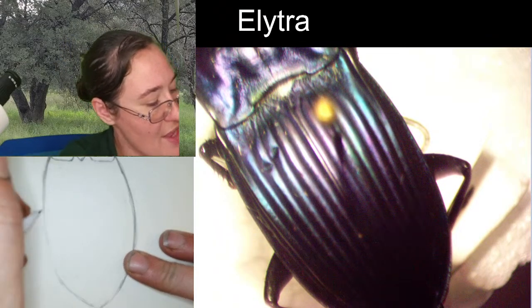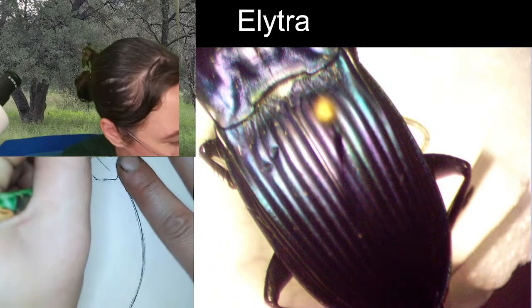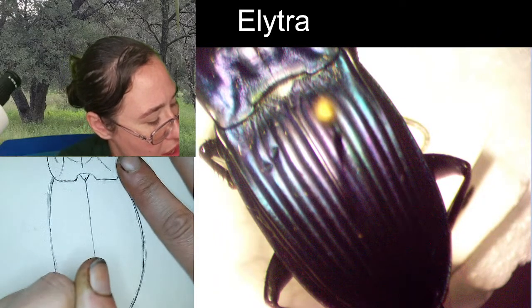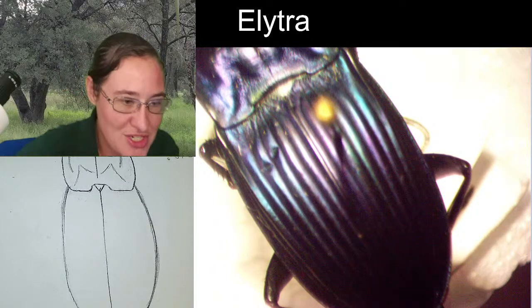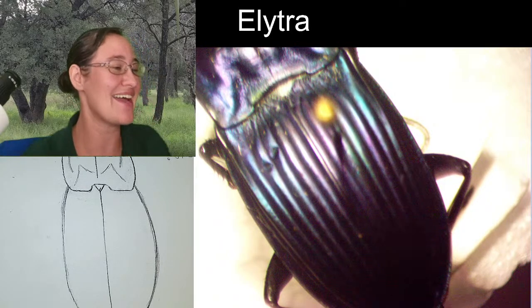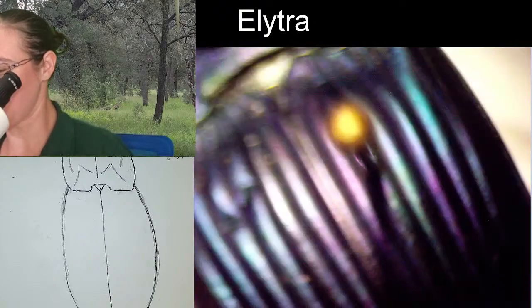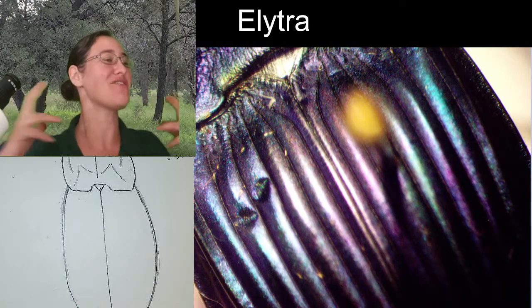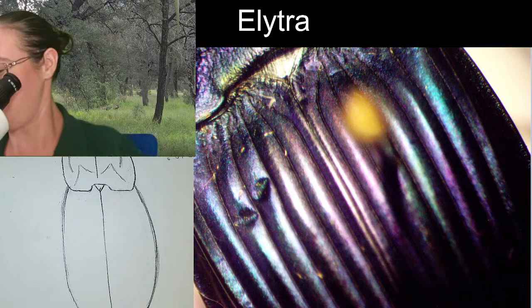Alright, so in the center of this space, we do have a vertical line. This separates the individual elytron. And then we've got all of these really beautiful striations. It almost looks like a galaxy. I have to agree. I love this specimen too, because the specimens can have a variety of colors, and this one has all of the best colors. It's like all of those metallic blues and the metallic purples.